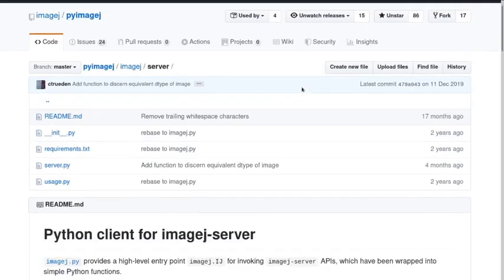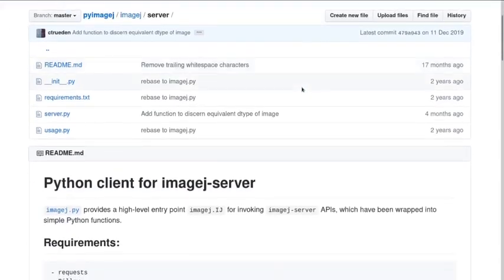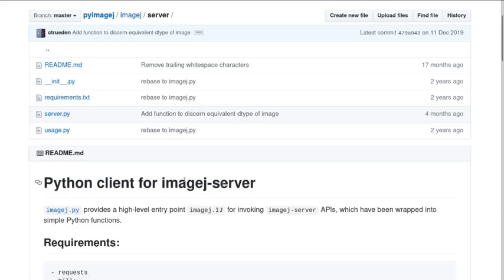The other thing I wanted to quickly mention about PyImageJ before going on to working with experimental development packages in general is there is a sub-module for PyImageJ called PyImageJ Server and this accesses, as I said, that new server mode of ImageJ. In theory, I actually think that the server, this PyImageJ Server looks like it's going to be more useful for Python writers just in the way that it interacts with PyImageJ Server and the ease of which you can send information to and from it.